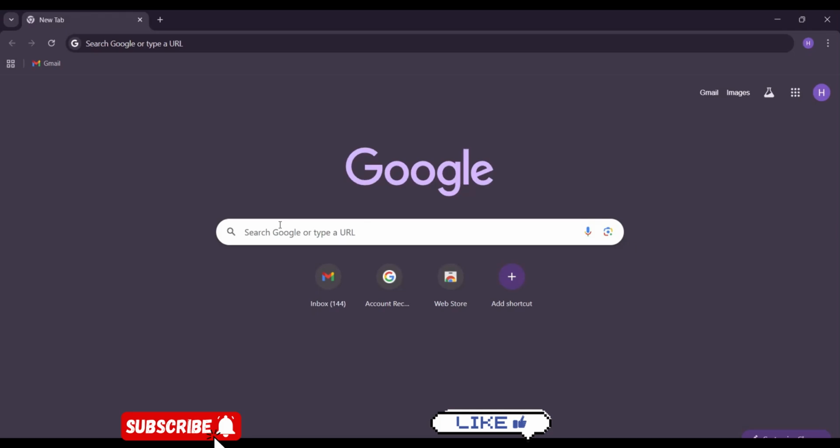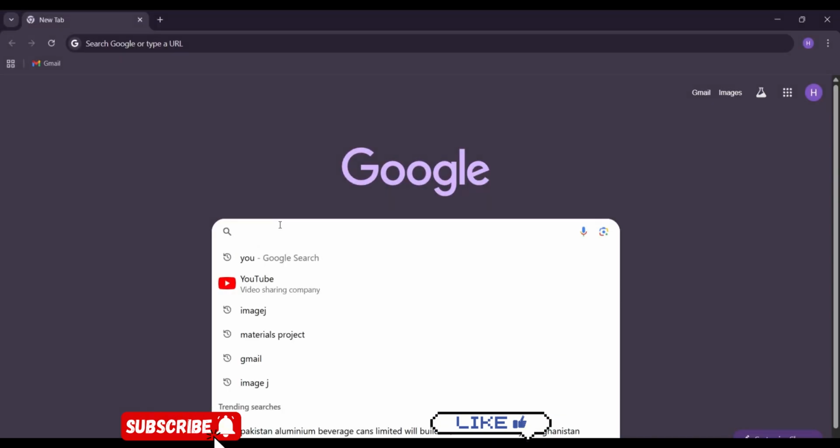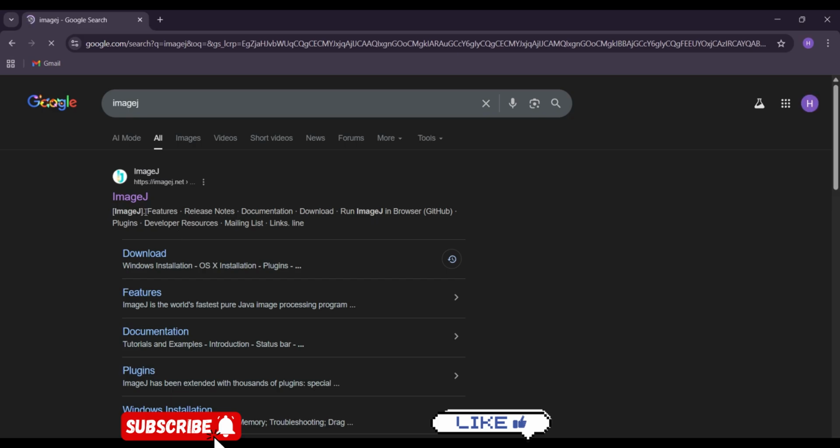Hello everyone, this is a complete tutorial of ImageJ software. First, I'm going to tell you how to download it and then I'm going to tell you how to use it efficiently. Type ImageJ on Google and open the first link.